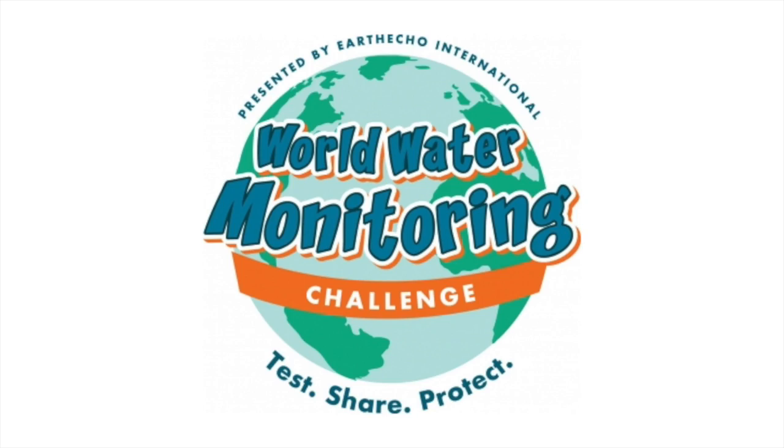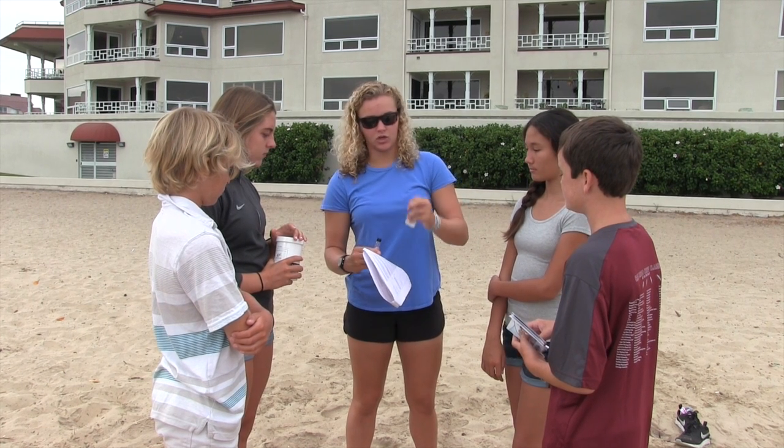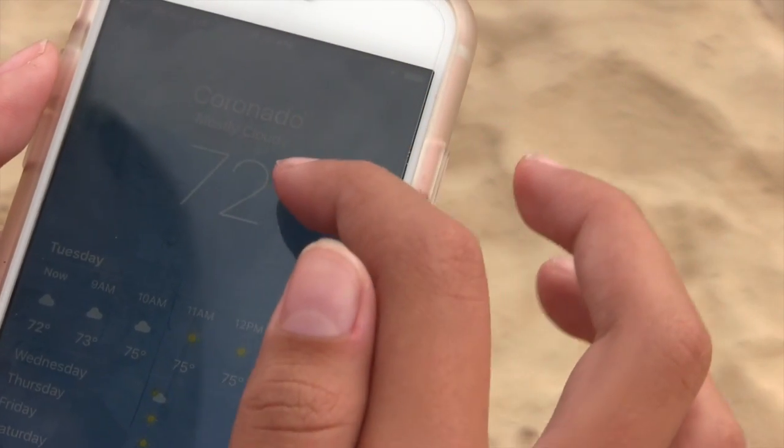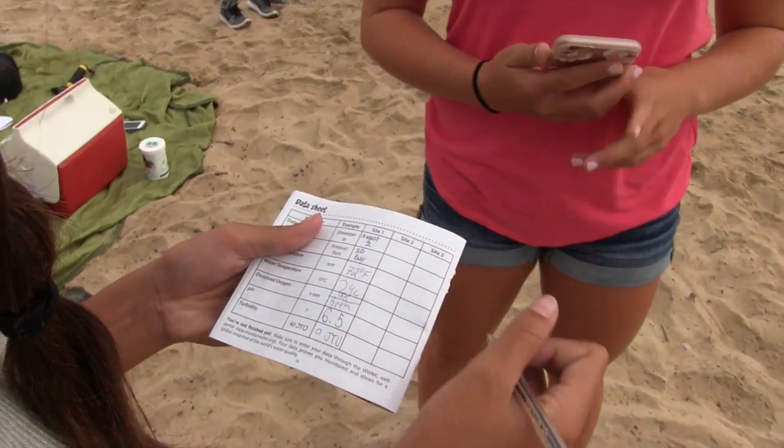As you can see, the World Water Monitoring Challenge is simple and easy to do. It only takes about 15 minutes to complete all tests. Remember to also make note of the air temperature. Maintain a log of all results to share with your community and with monitorwater.org.